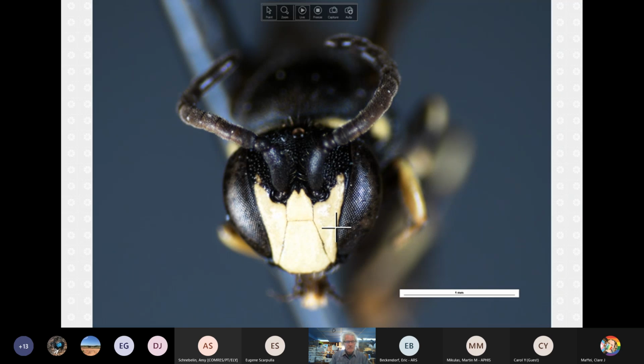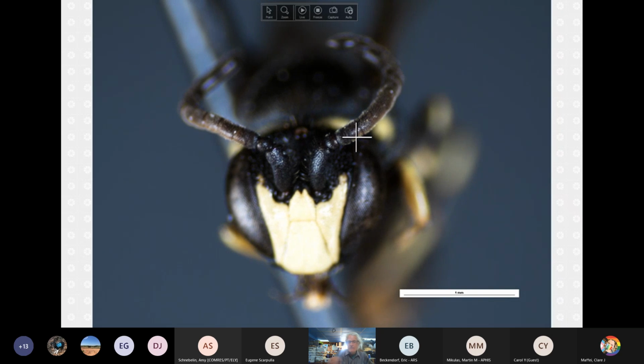So we'll show affinis in a second. Additionally, people are often comparing, let me change the, oh, you see, I even have a scale bar on here now. Look at that. So another character here, we have the very standard modestus.